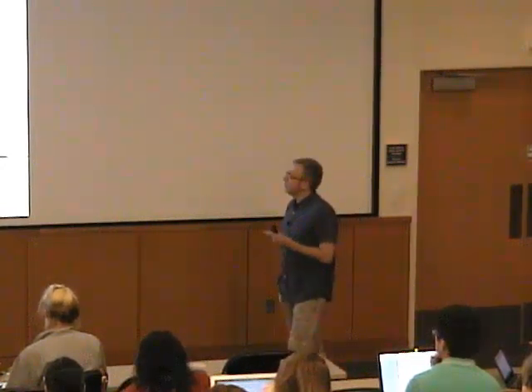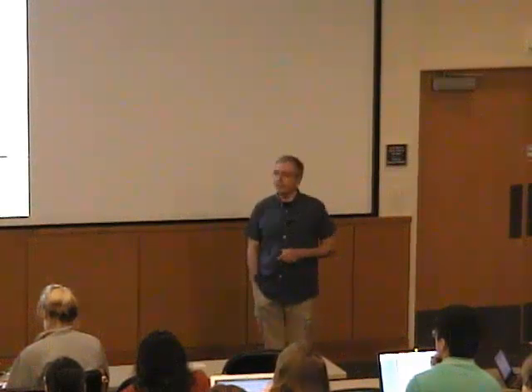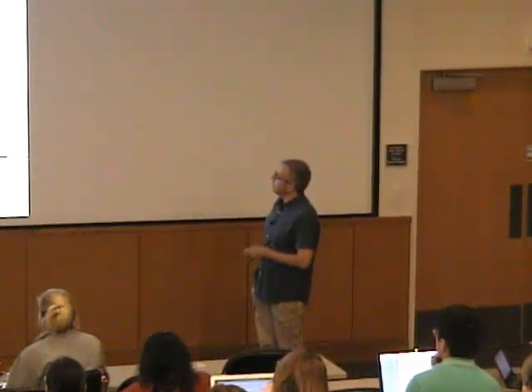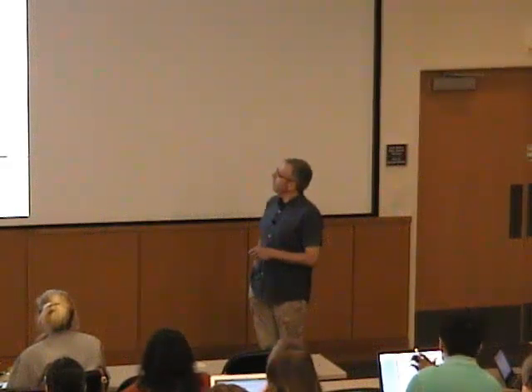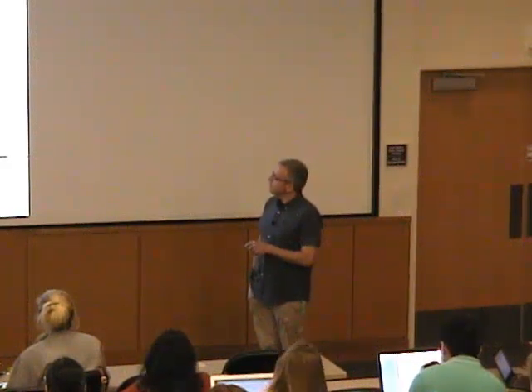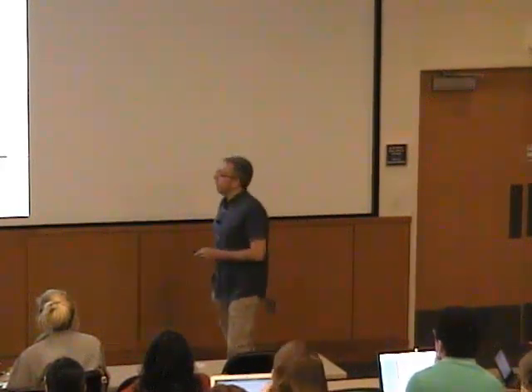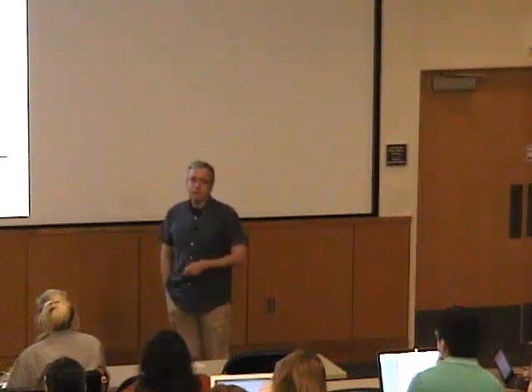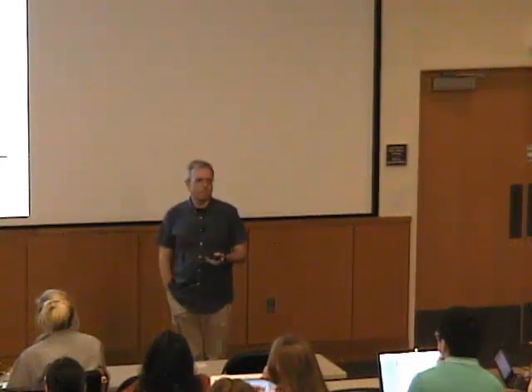Okay? And this is what our waves do, and this is a complex exponential as figured out by Leonhard Euler, Swiss mathematician. Looks quite Swiss to me anyway. Who came up with this wonderful relationship showing that in complex space the exponential function is periodic. And so all the waves that we have in our diffraction experiment do this. Okay, that's kind of complicated.